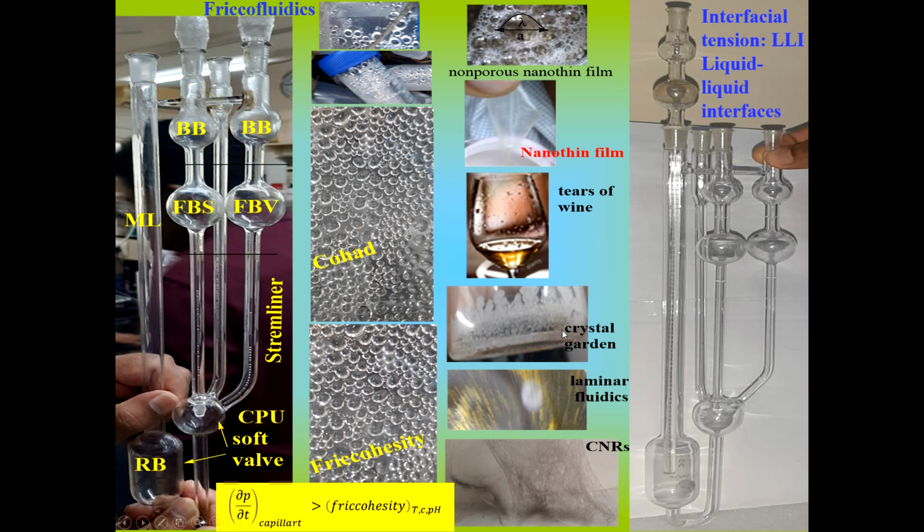And now crystal garden. Why are crystals going up? Because of the nano hydration, as I told you, both the anion and cation were hydrated. And when this evaporated, they are going up. So what happens with this? First some crystals grow here, then again they grow. So height is gained because it indicates adherence.